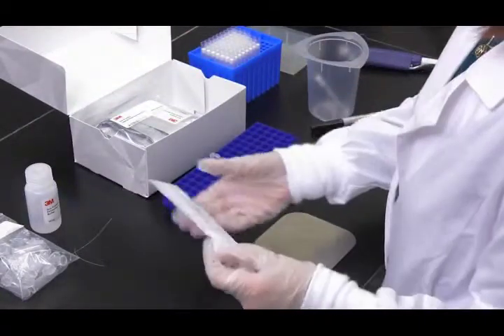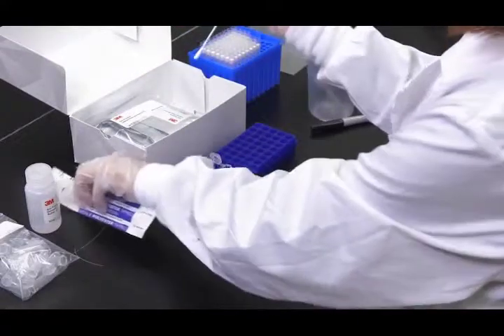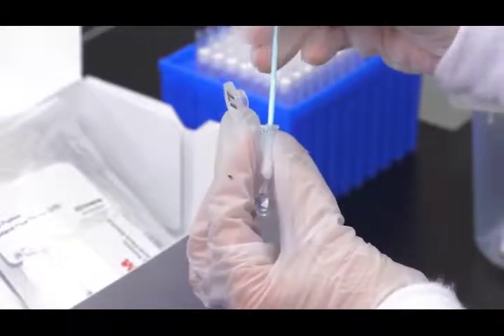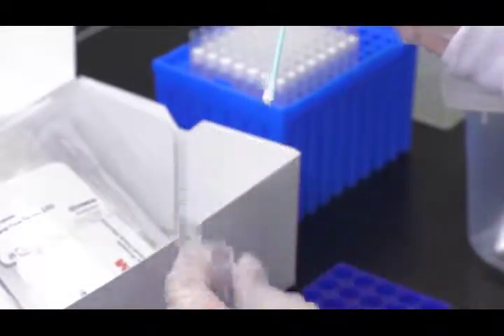Next, take a sterile swab and dip the entire tip into the microcentrifuge tube, wetting the tip with the 3M extraction buffer. Gently express excess liquid from the tip by pressing the swab tip lightly on the inside of the tube.